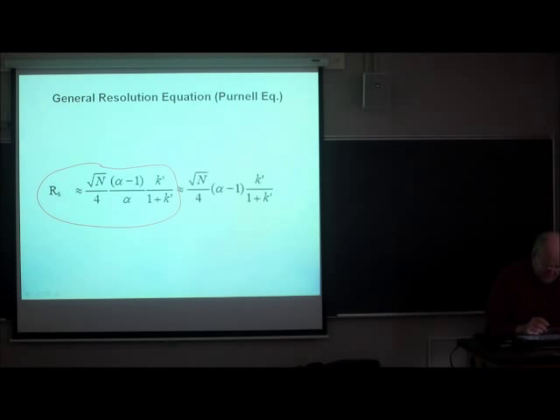So, we see that resolution depends upon three factors. It depends upon the efficiency or plate number. It depends upon the selectivity, also called band spacing. And it depends upon the amount of retention.